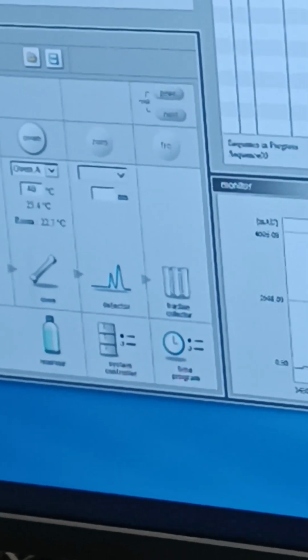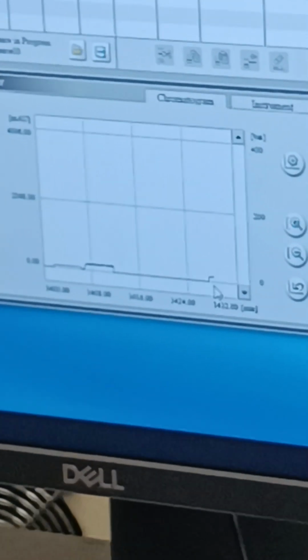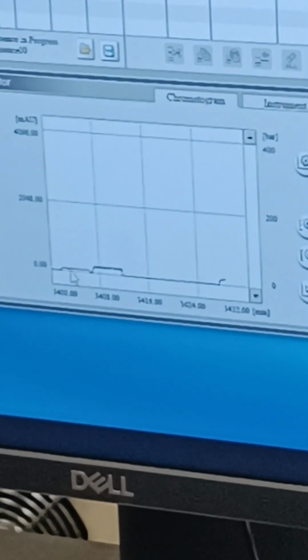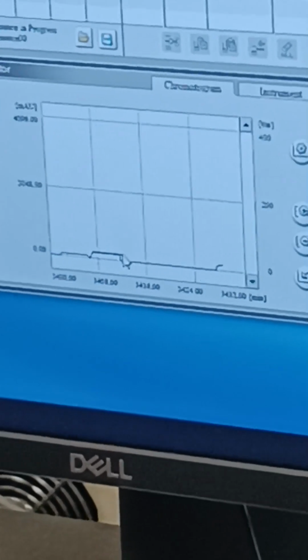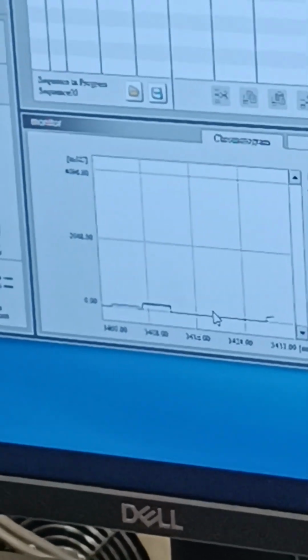Just wait for a while. So usually once we press the pump, it means start flushing, right? And then this pressure bar will be going up and down, it will fluctuate. And then how you can see is from here. So usually here I will wait at least 1 or 2 minutes just to make sure that it won't fluctuate. If it shows something like this, like a straight line, it means stable, which means there's no contaminant inside. Yeah. So this one I will just wait for a while, maybe 2 minutes first.